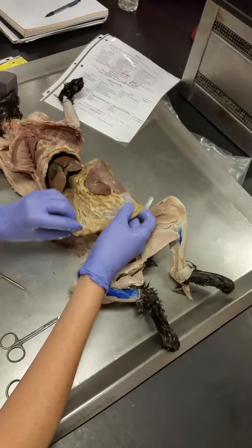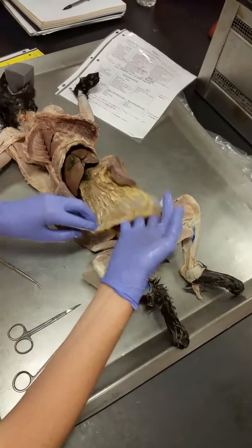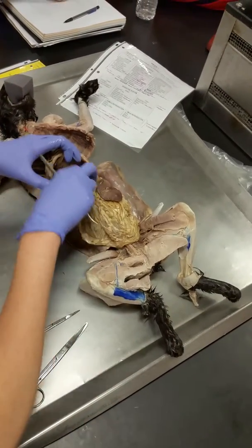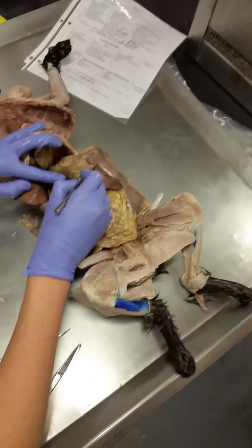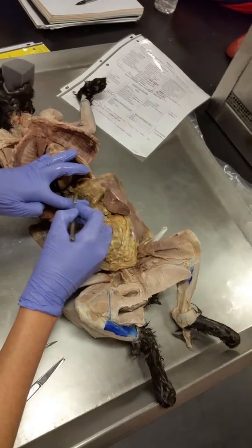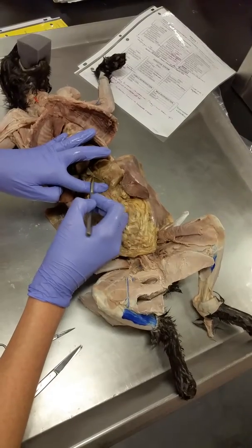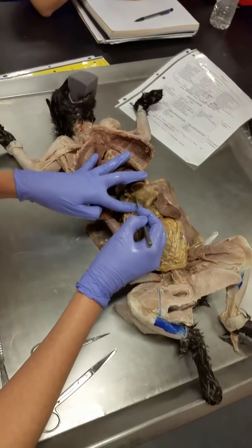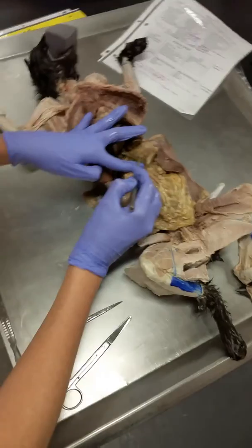Okay. So this is dorsal mesentery. It's the greater omentum. In an embryo, it was dorsal mesentery. And then there's also a lesser omentum. Okay. And lesser omentum is kind of sitting on top of the stomach. And I'll turn it around so you guys can see it too. But can you see there's this bit right here? Okay. That's lesser omentum. And lesser omentum is made of ventral mesentery. Okay. So both the falciform ligament and the lesser omentum are made of ventral mesentery. Okay, so it's this little guy right there.